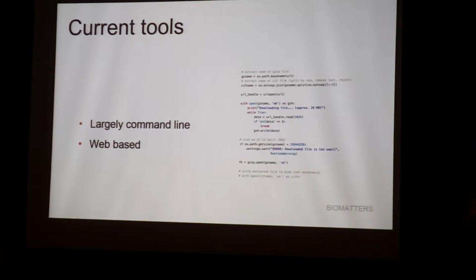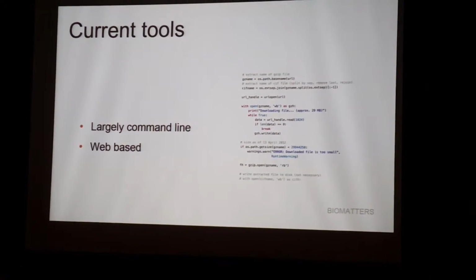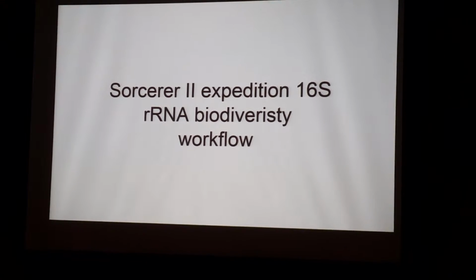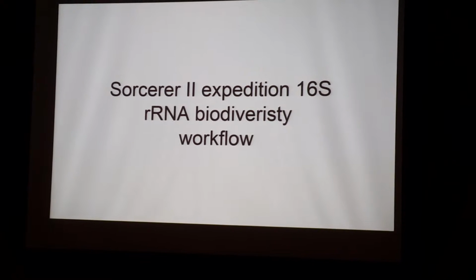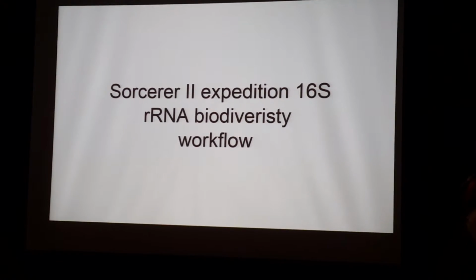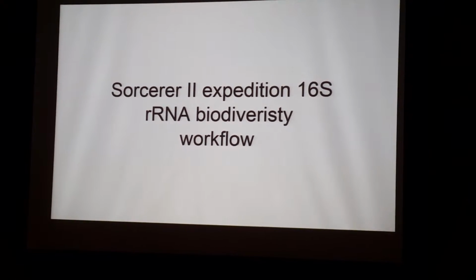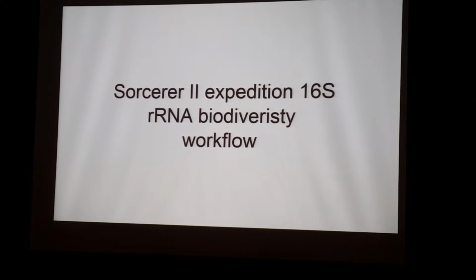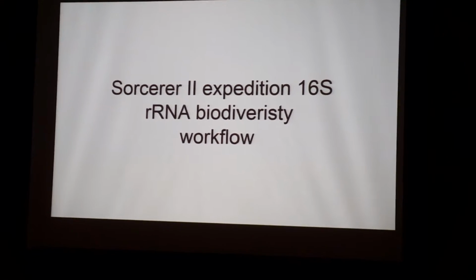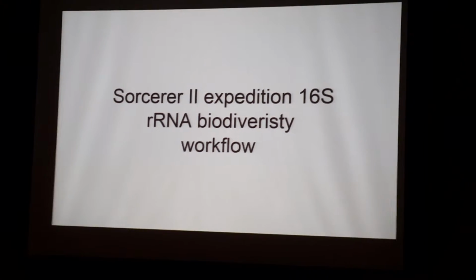So in terms of software that's available, this has become a really big problem because there are really no good tools for 16S analysis. Most of the tools that are available come in two flavors. The first is things that are command line driven, which is a huge problem for most biologists, right? So just trying to script and hit things programmatically is a big issue. And there are programs to do it, but again, the barrier to entry for most biologists is quite high because it is command line driven.